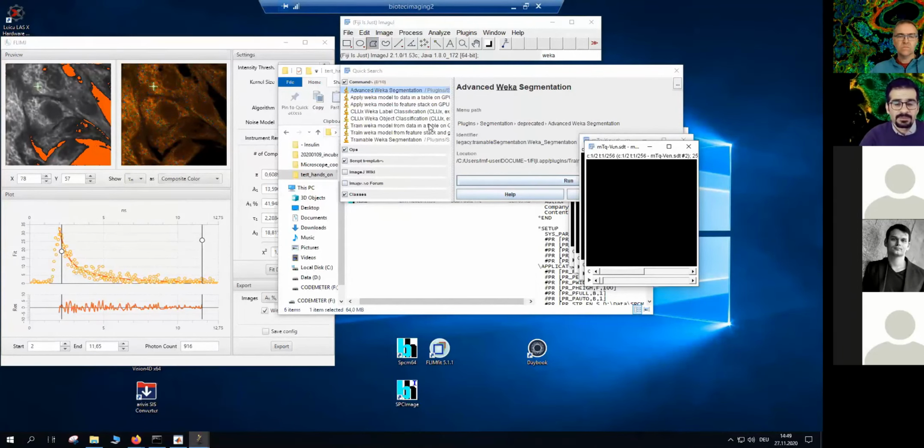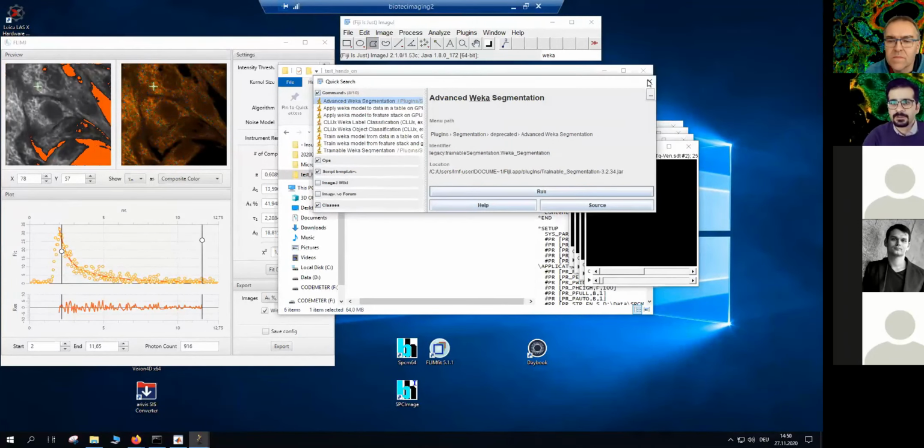Also, if you have very large data and a lot of data and complicated analysis, you can use CLIJ, which is like a GPU-based analysis in Fiji. There are always updates in this package for the analysis on GPU as well. So it can do so many things. That's the whole point that I'm repeating: using Fiji plugins for FLIM analysis.